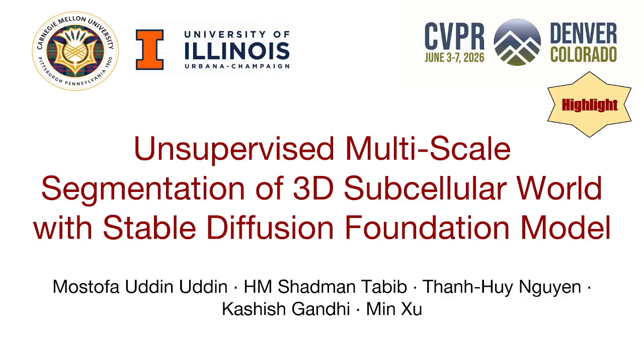Welcome to the presentation of our CVPR 2026 highlight paper, Unsupervised Multi-Scale Segmentation of 3D Subcellular World with Stable Diffusion Foundation Model. In this work, we leverage the internal learning mechanism of the Stable Diffusion Foundation Model to segment subcellular objects across multiple scales from extremely noisy and crowded in situ 3D microscopy images of cell.